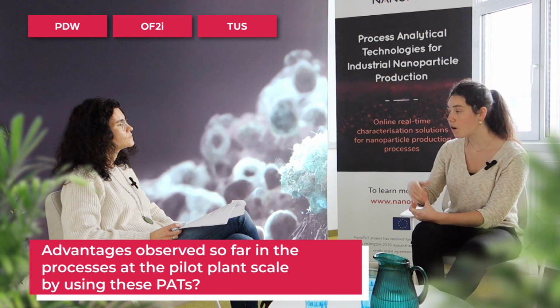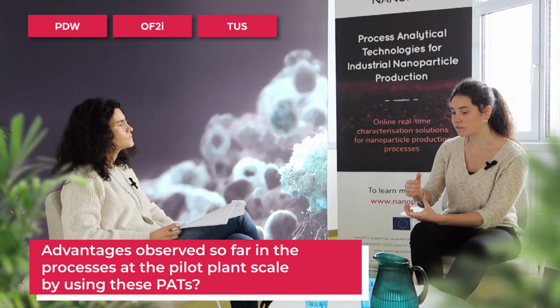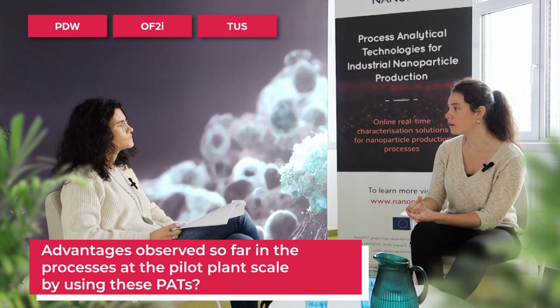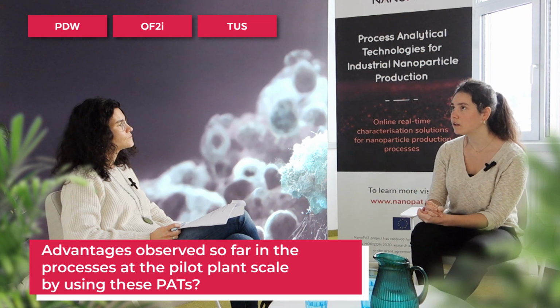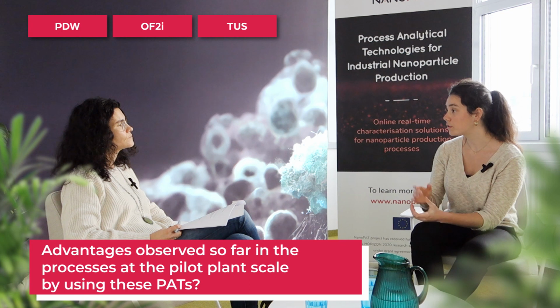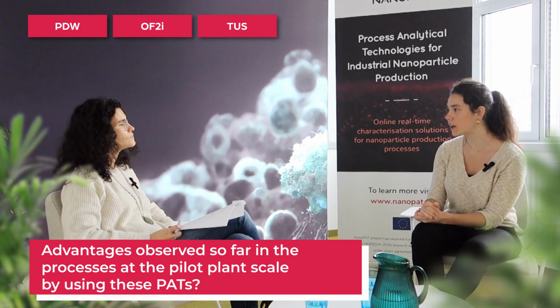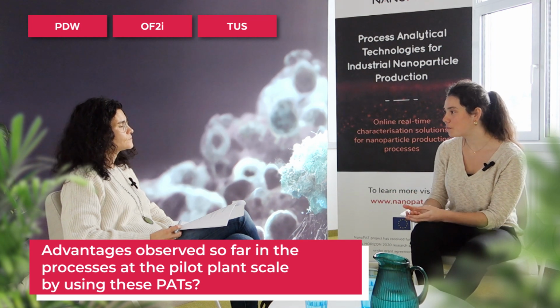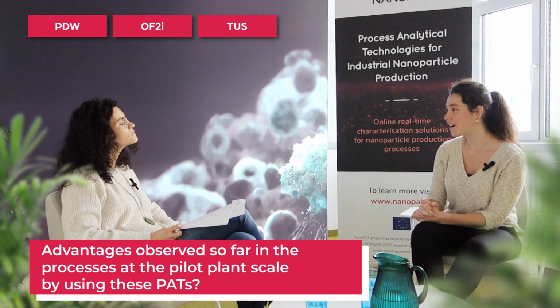Regarding the other two, they are online monitoring techniques. So in both cases, we have a dilution system, which may give some problems that I will talk about after. But for example, a really good thing is that in the OF2i, even if we have to dilute the sample, we only need to take some microliters of sample from the reactors. That's a very, very small amount, and it's a small amount for a lab scale where we are working with 1-2 liter reactors, but even less significant at an industrial scale where we are creating hundreds of tons of material. So this is already a really good thing.